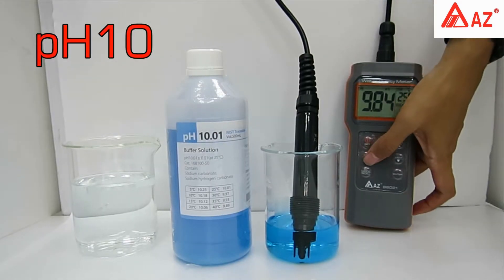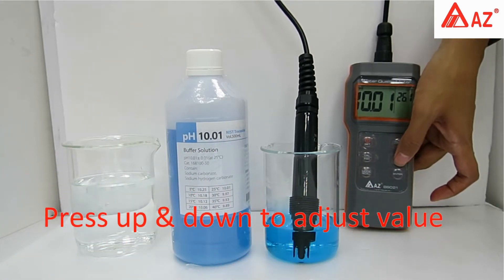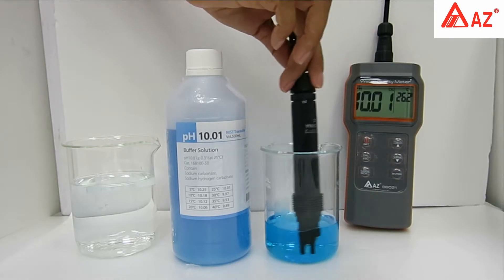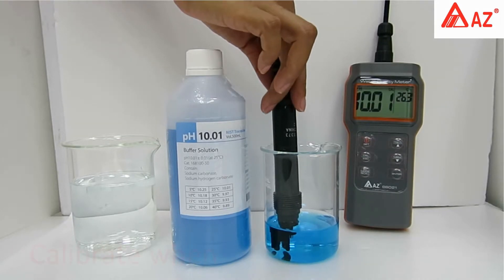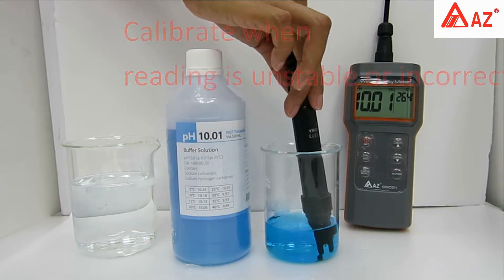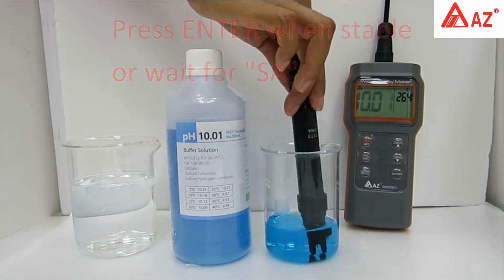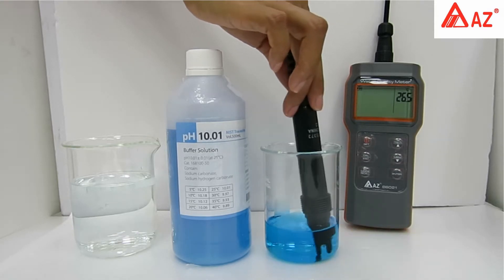For pH 10, long press Cal to enter calibration and set the standard value using the up and down keys. Rinse probe with deionized water, then use a transparent container and make sure the pH electrode is completely immersed in buffer. Stir gently to get a homogeneous condition. Do not reuse standard buffer. Once the reading stabilizes, press Enter or wait for the save icon. Rinse probe with deionized water after use.